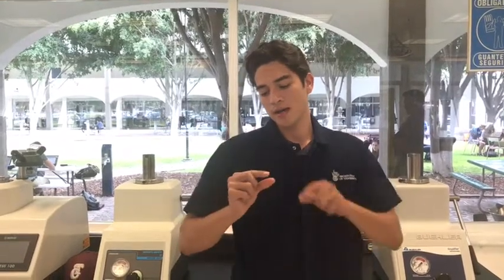Hi there. In this lab, we are going to talk about the proofs of number of grains in different types of materials. We have steel 4140, and we are also going to check the aluminum. First of all, we have to cut the material to get a simple circle of material.